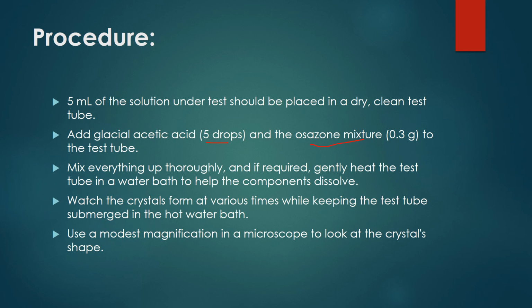Watch the crystals form at various times. That means the crystals will form at different times for different reducing sugars. If the sugar in the sample is a non-reducing sugar, no crystals will form, but we are talking about a sample having a reducing sugar.